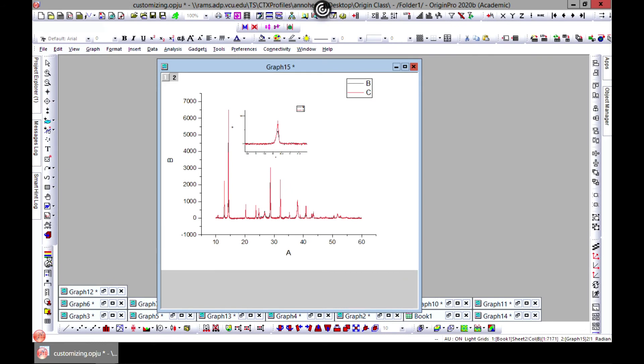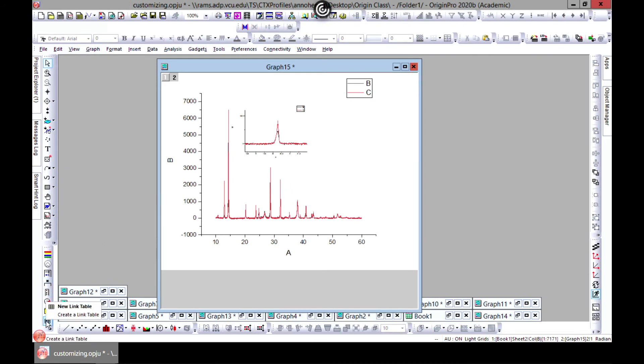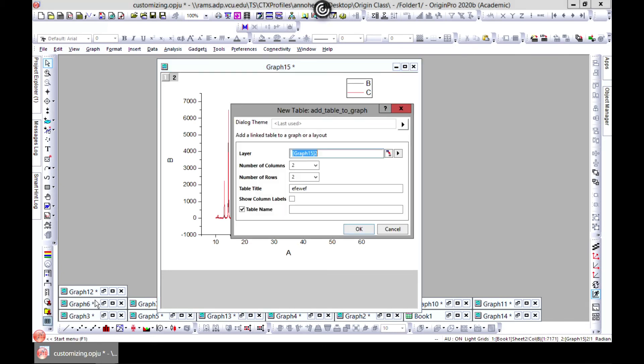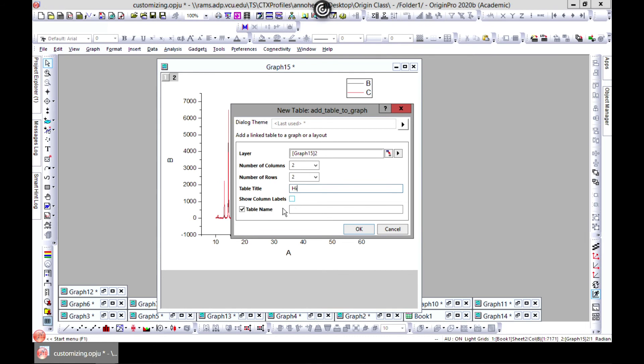So that is this one. And then the last one is Create a Link Table. And this is our graph, Graph 15. The number of columns, let's say two. Number of rows, let's choose two. We can add a title, let's say 'hi.' We can show labels. We can add a table name as well. Let's keep it this way.